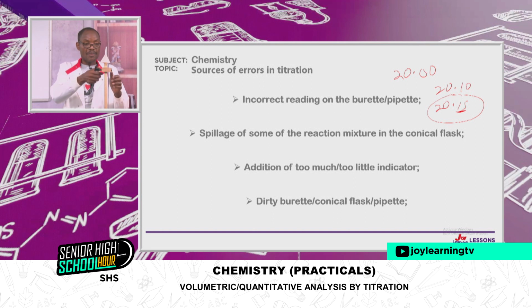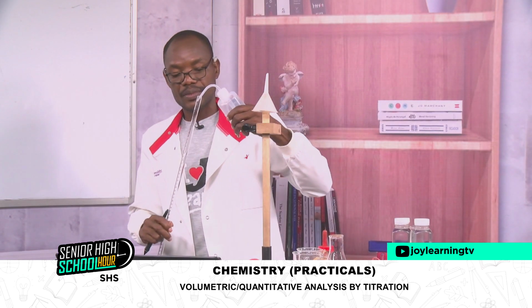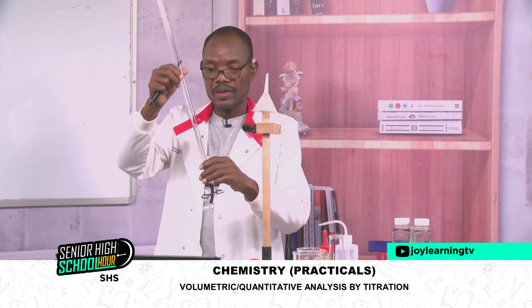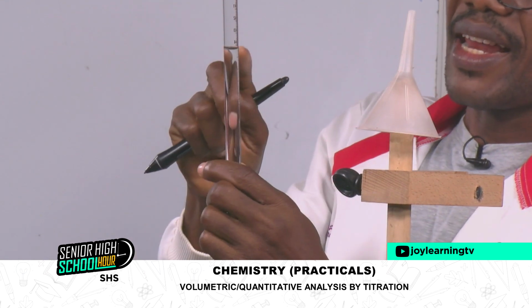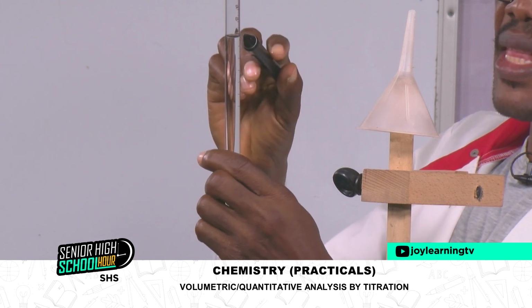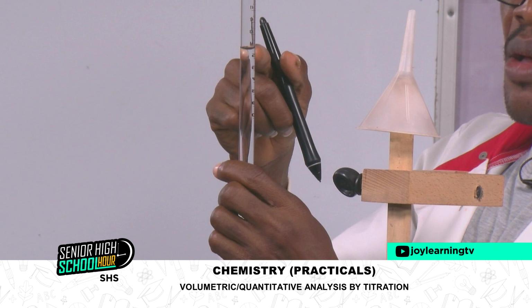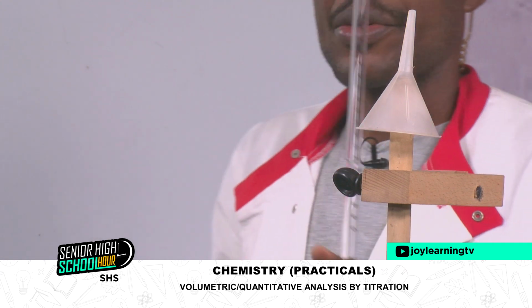And take note that a meniscus is formed in the burette. So it forms a curved surface. This is a colorless solution. So if you want to read, you must read at the bottom of the meniscus, where the curve is just touching a calibration on the burette. If you read on top, that will be an error. So instead of reading from the bottom of the curve, if you read on top of the curve, that can also affect the accuracy of your work.